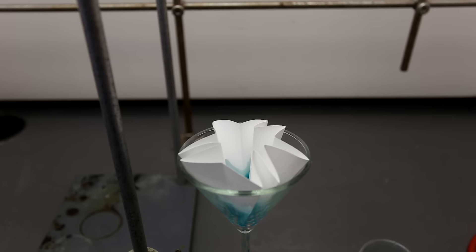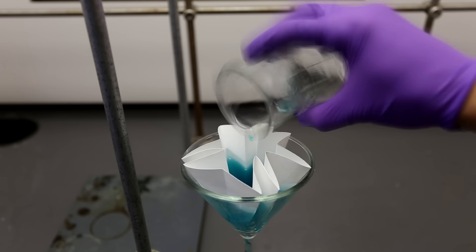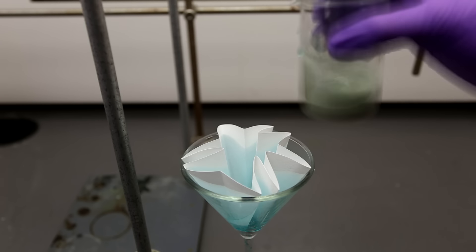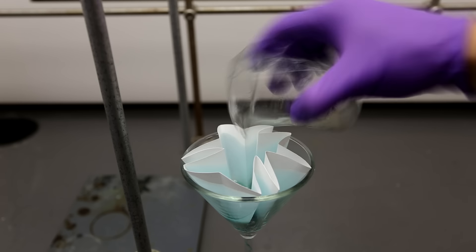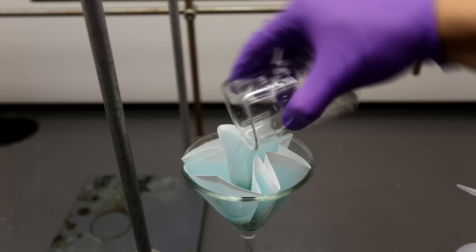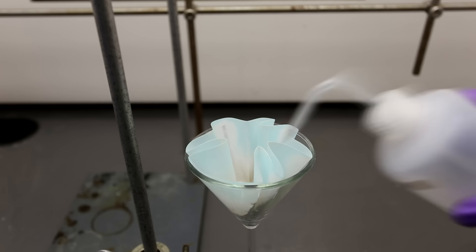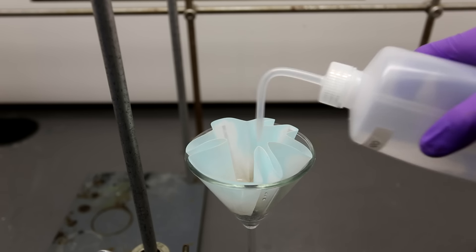The next step is to filter off the silver. Pour it through the filter paper, let it drain, and wash the empty beaker and the silver precipitate several times using water. I used a squeeze bottle to knock down the silver precipitate that was lodged on the side of the filter paper.